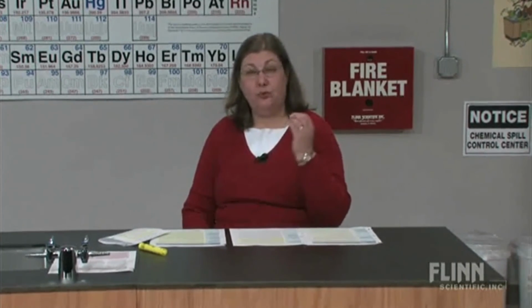We do have detailed instructions for all of these biological safety topics on this laboratory safety course website. Again, we have the dissection safety. I went through some of these fairly rapidly. I do urge you to consult those detailed instructions. If you have any questions about them, you can call us or email us, and we'll be happy to describe them.